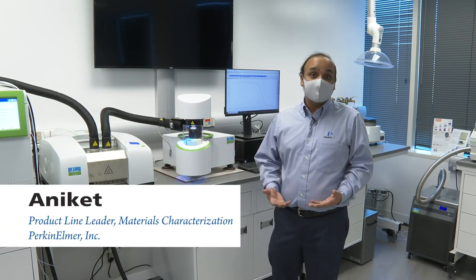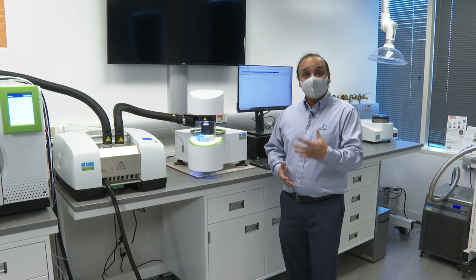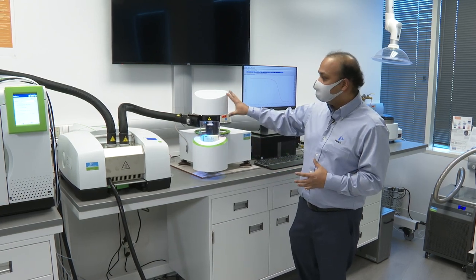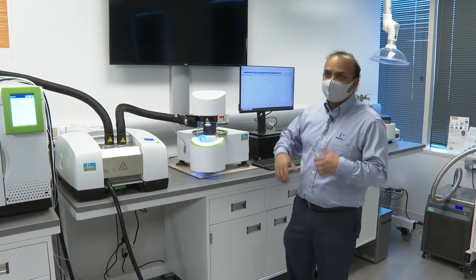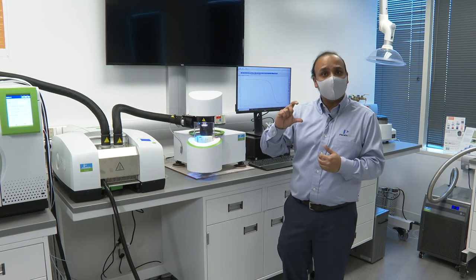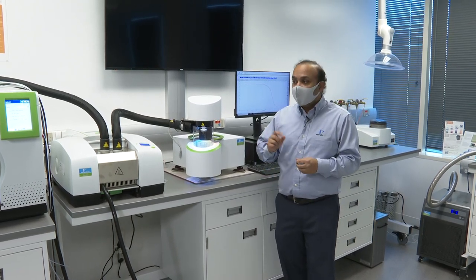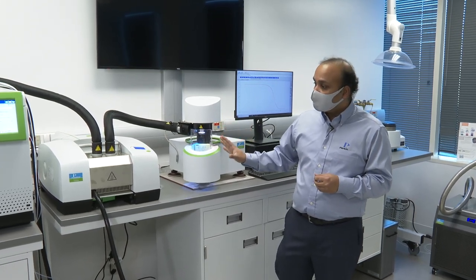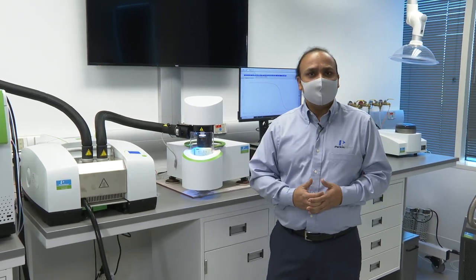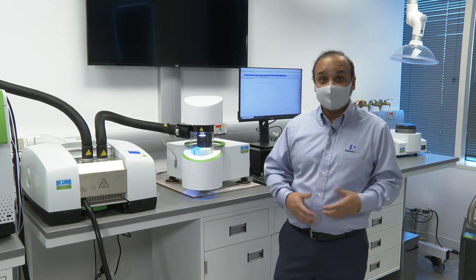We're here to talk about PerkinElmer's hyphenation capabilities for evolved gas analysis. Evolved gas analysis refers to the detection of gases that are evolved as a material is decomposed, usually in a thermal instrument such as the TGA. What we have here is a combination of TGA, infrared, and GC mass spec. TGA gives you quantitative information — how much of a material is decomposed — but the missing part is you do not know what it decomposed into. That question mark is what can be answered by hyphenation, which is a coupling of multiple analytical techniques into one.